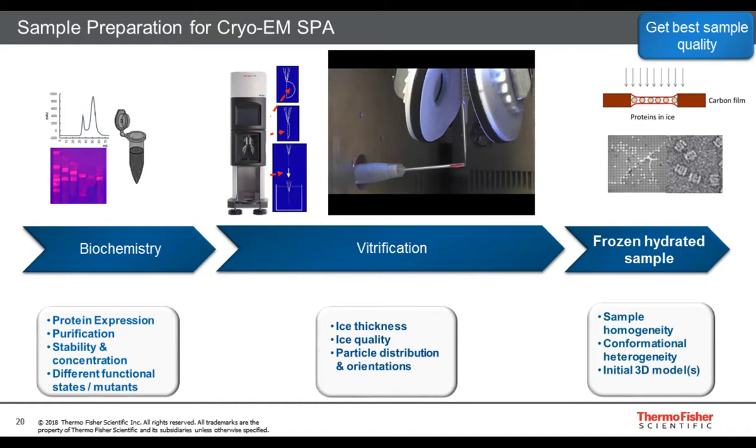And currently screening is a crucial part of the single particle workflow. How you do this, there are various ways to do it. Typically, one of the steps that people apply a lot is to take a piece of the sample and apply a heavy metal stain to it, which we call negative staining, and by looking at the heavy metal contrast in the microscope, typically a smaller microscope, a Talos L120 for example, or another 120 kV microscope, gives you the information about the protein aggregation or the particle distribution.